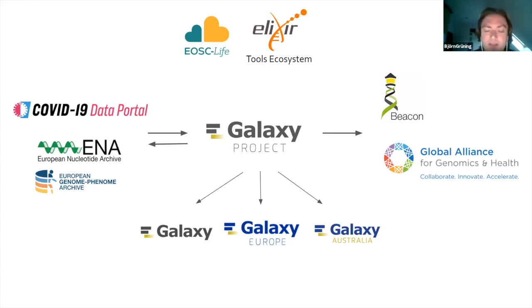Also, all around the world you get free compute resources to analyze your data no matter where you are. You can process thousands of datasets in parallel, and in the end you get them available in annotation databases like Beacon that put some sugar on top and visualize them, which makes it easy to filter all these variants across hundreds, thousands of genomes. And this is all free to use for any scientist in the world.